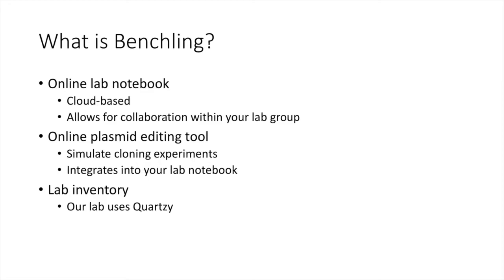So Benchling has a couple of distinct functions that all integrate together. First of all, Benchling is an online lab notebook, which can be used as an alternative to your physical notebook. As it is cloud-based, it allows for collaboration within your lab group. Benchling is also an online plasmid editing tool, which allows you to visualize and analyze the sequence of plasmids and other DNA sequences. You can then simulate cloning experiments. And the plasmid editing tool integrates into your lab notebook.